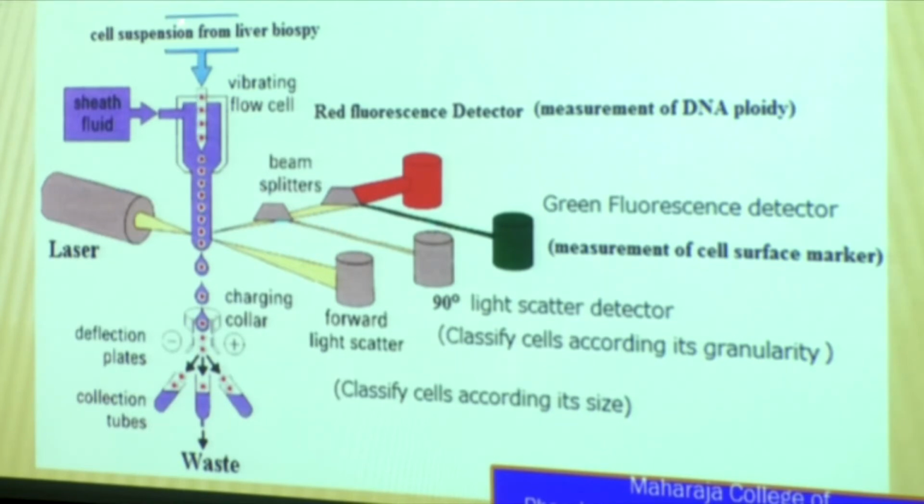What is involved? You take the blood, process that blood sample, and then put it through this nozzle. This small nozzle will allow you to put drops and drops where you have probably 1 or 2 cells at a time. Before sending it through, you mix a luminescent marker into that blood, which specifically binds with cancer cells, not with the normal blood cells.